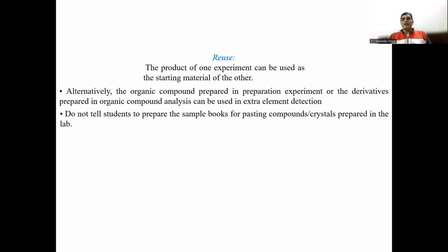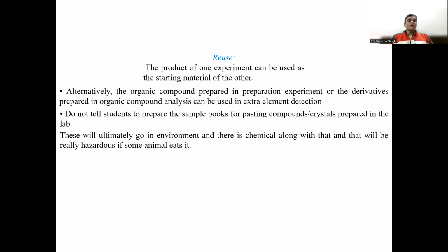Such chemicals may come out through these poly bags and stick on the notebook, and you generally use this notebook even at home, so they may enter your body and cause a very harmful effect on your health. So never adopt such a procedure as was generally adopted previously.